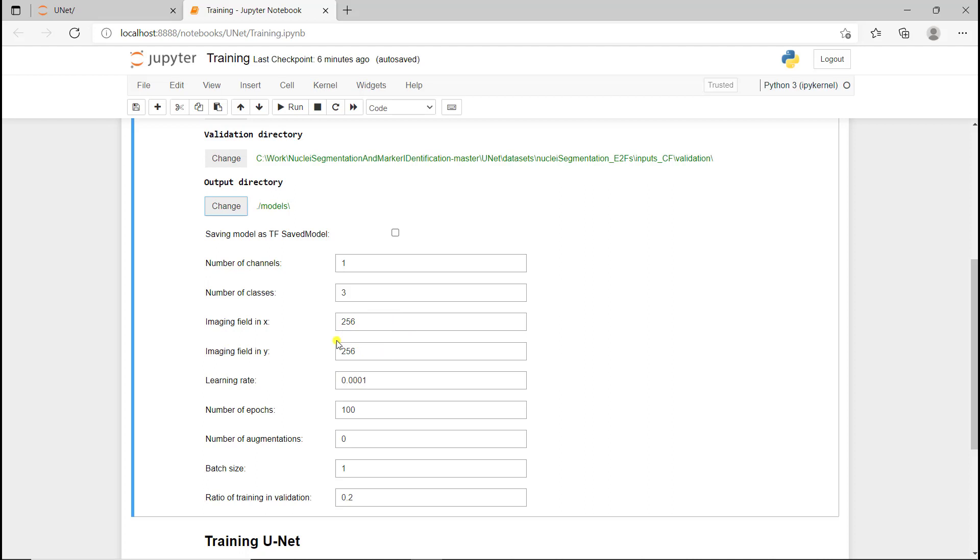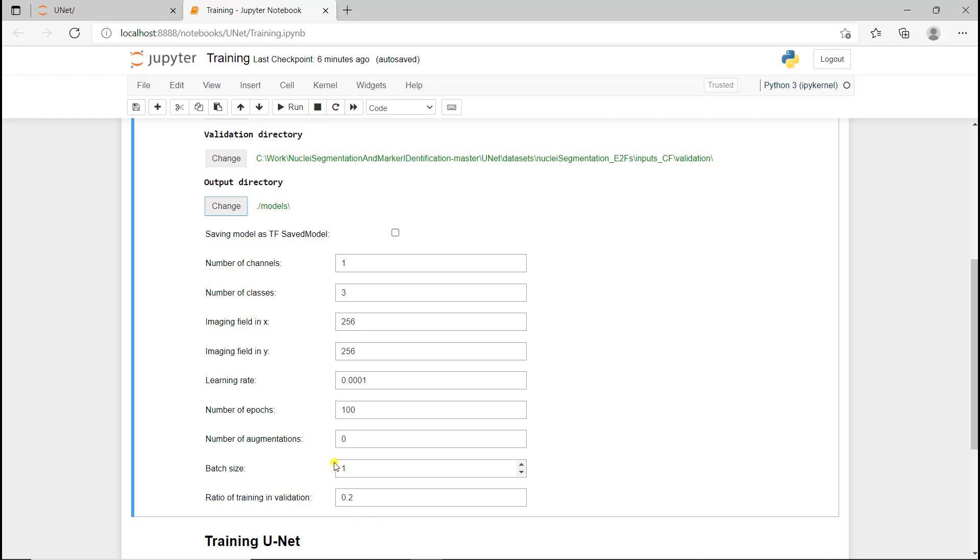We need to define the learning rate, so we're going to keep it at this value. We could change it obviously. Then we have the number of epochs. We're going to keep 100 epochs, and the number of augmentations. We're not going to do any augmentation. That's something we could test if you train this model and use this notebook, but here we're going to keep it to 100 epochs and no data augmentation.